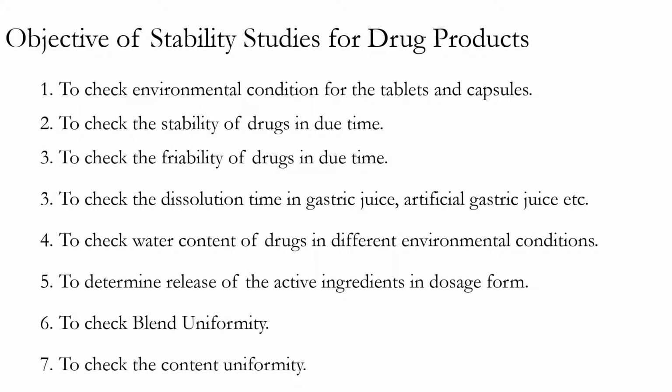So the main objective of the stability study is to check the environmental condition for the tablet and capsule, to check the stability of the drug over time and the friability of the drug at a given time. Whatever we have fixed, we are going to fix.